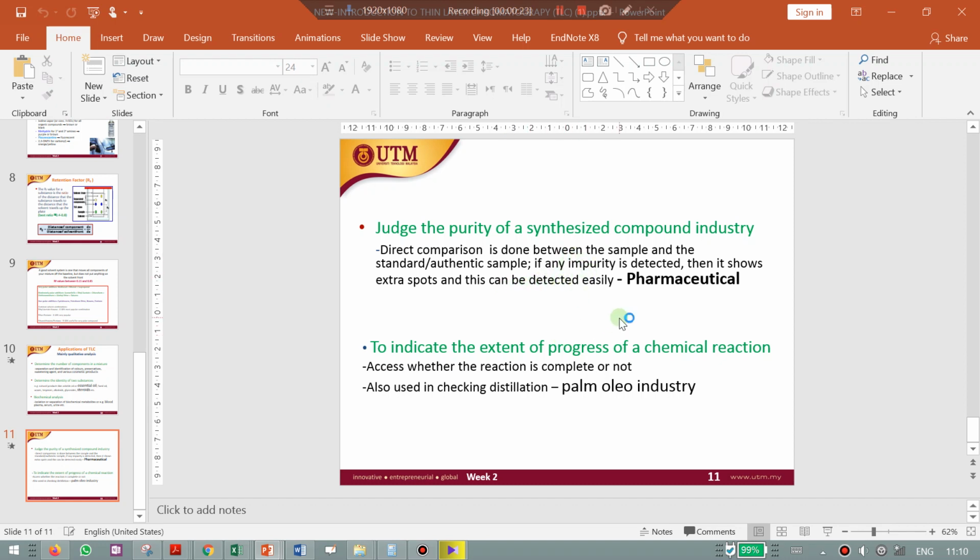In the pharmaceutical industry, for example in paracetamol production, diorang dapatkan daripada syarikat Panadol, they get the Panadol, they perform the spot test. The company said they have a sample from outside, and they say this is a counterfeit product of paracetamol, maksudnya ada produk palsu paracetamol.